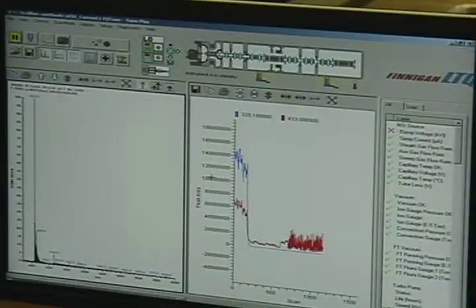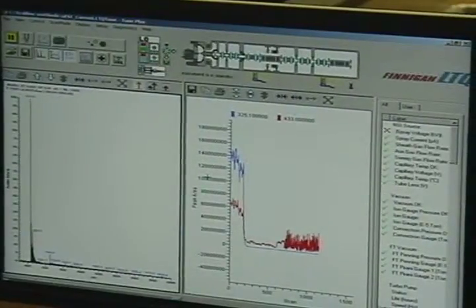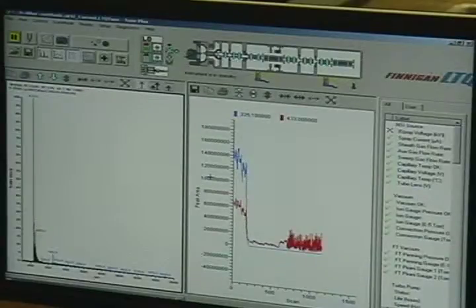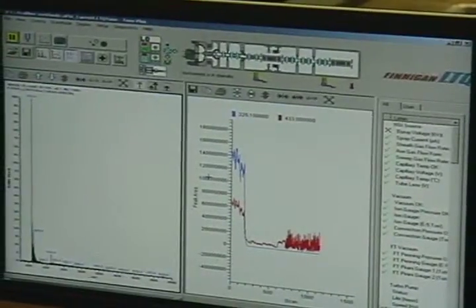But that's why I use 0.02% TFA, a little bit of TFA, to improve my peak shape. Those two systems seem to give me my best results. So you just do 0.02% TFA with 0.1% acetic acid? So it's a blended system. The acetic acid improves my protonation, the TFA improves my chromatography. Or you use the second system, which is just 0.1% formic acid, which does both chromatography and protonation.